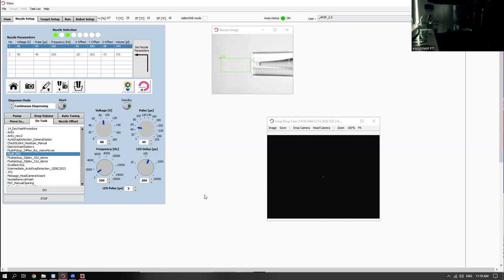And these are not autofluorescent at all? No. But we can make them fluorescent. That's another thing. I think that's your best bet. But it's possible that just based on the transmission, if it does interact with the light differently, we can look at the intensity of that difference between the background and the foreground.